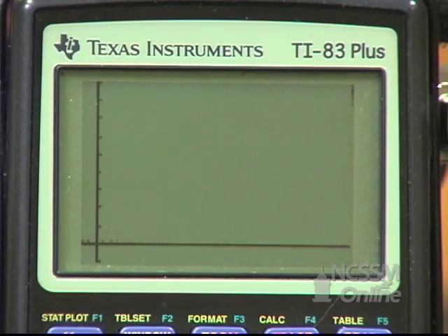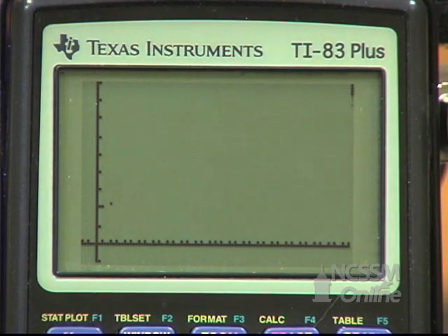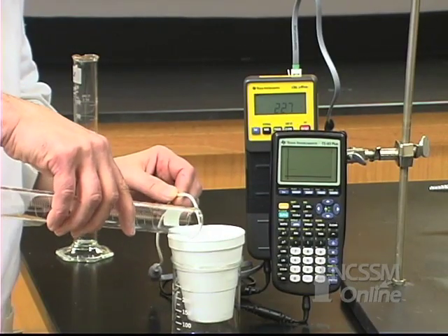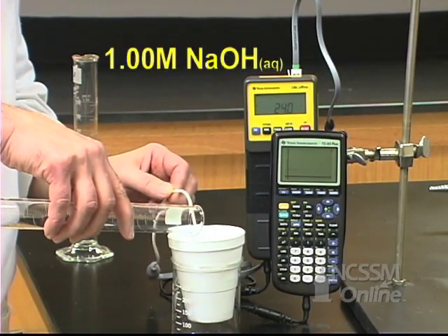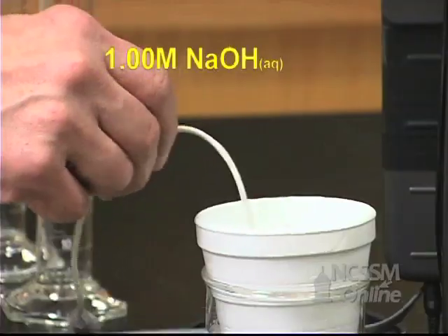Wait for two or three data points to be displayed. Then add the sodium hydroxide solution. Stir the solution with the probe to make sure there's thorough mixing.